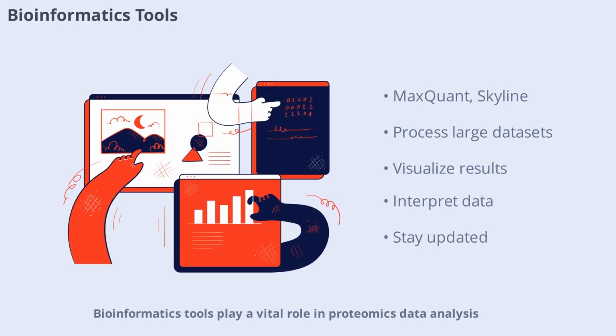Bioinformatics tools play a vital role in proteomics data analysis. These software applications help process, visualize, and interpret complex datasets. Popular tools include MaxQuant, Proteome Discoverer, and Skyline, each offering unique features for different analysis needs. By leveraging bioinformatics, researchers can handle large-scale data efficiently and extract meaningful biological information. Staying updated with the latest tools and techniques is essential for successful proteomics research.